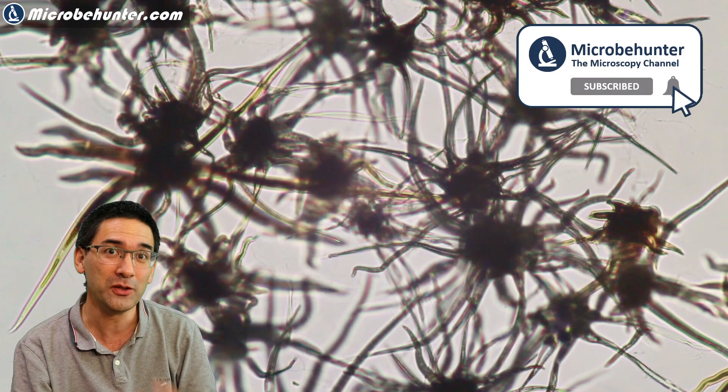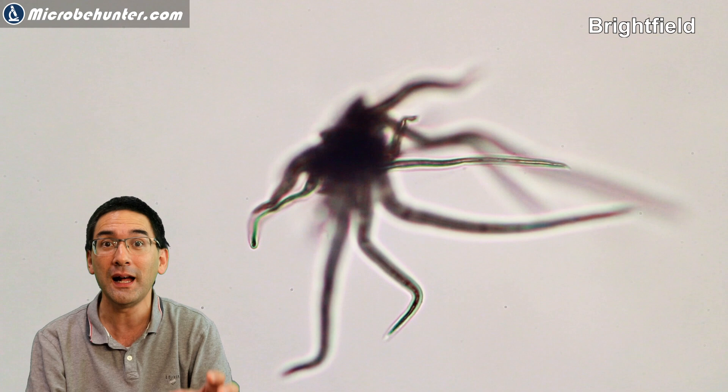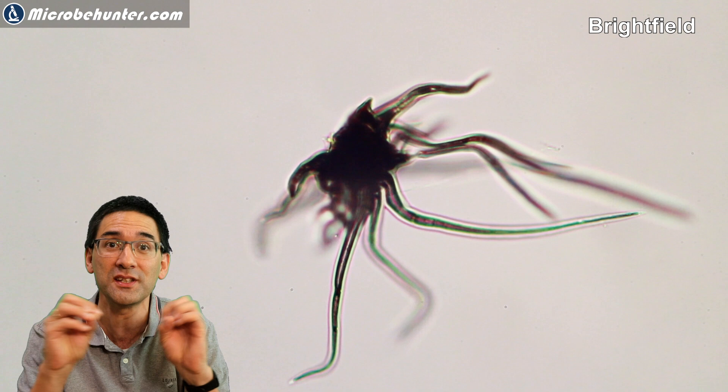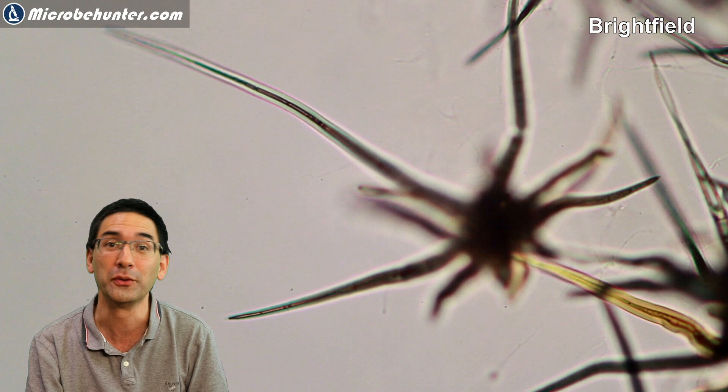You can find trichomes occasionally even in water samples, because some leaves may have shed them, and they end up in water — even in house dust, for example. There are many different shapes; on this plant they have a nice interesting star shape, but they can come in all kinds of different shapes and forms because they also have different functions in a plant.